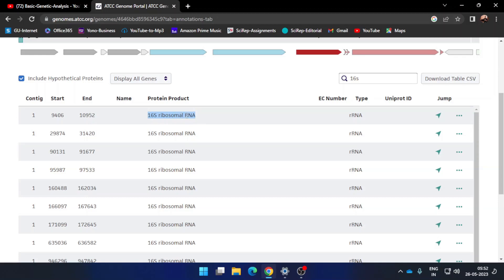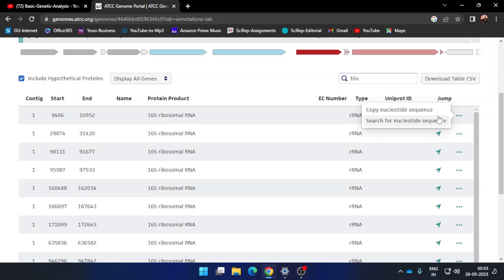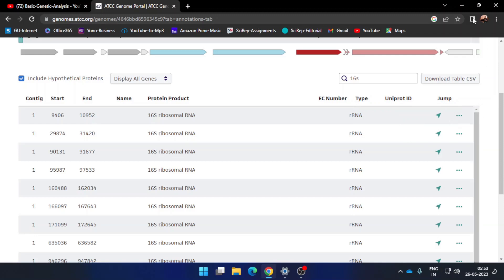As soon as you type 16S, an option will appear saying '16S ribosomal rRNA.' It will show the start and end position of this gene within the entire genome. To retrieve the sequence, go to the right-hand side and find the three-dot button and press it. Two options will appear — choose the first one which says 'Copy Nucleotide Sequence.'